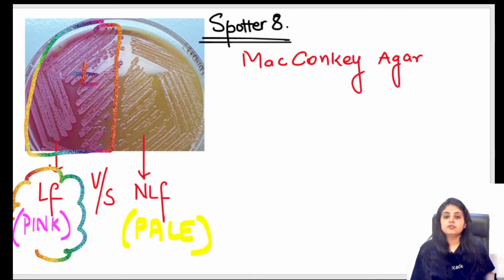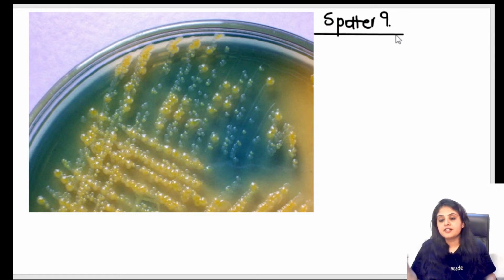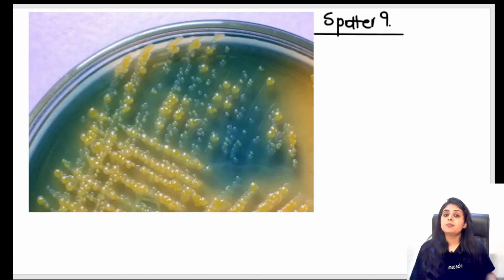Because this was spotter 8, I have to continue it with spotter 9. What is this? A very important one. Waiting for some answers. CLED, perfect. Like I said, because we were talking about one lactose medium, I have to talk about the other lactose medium also, and that is going to be CLED.